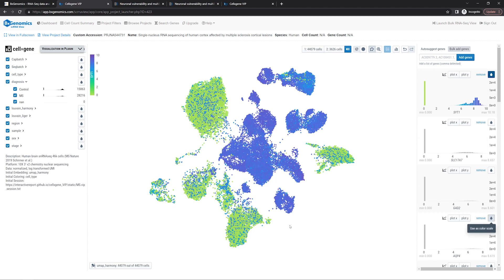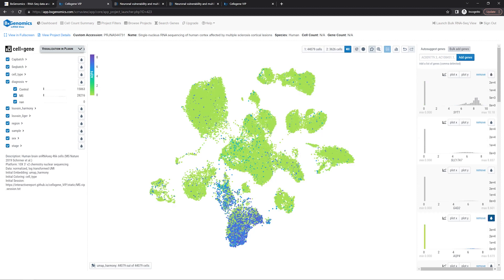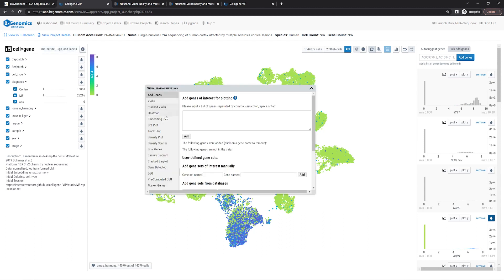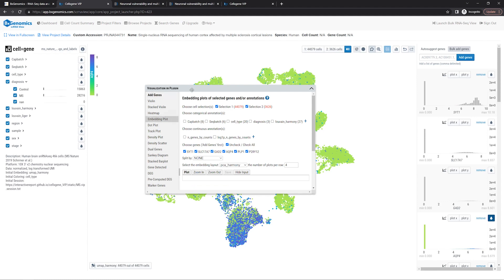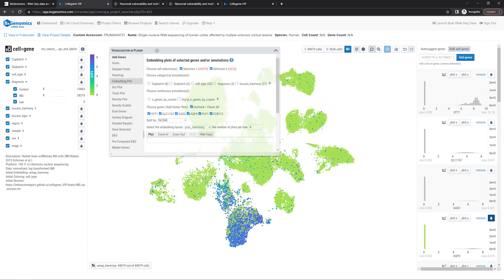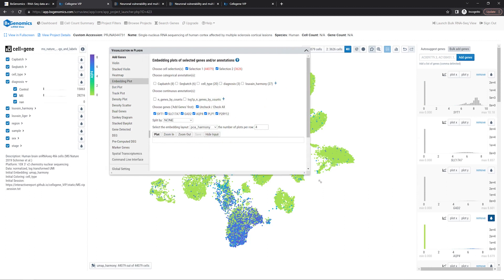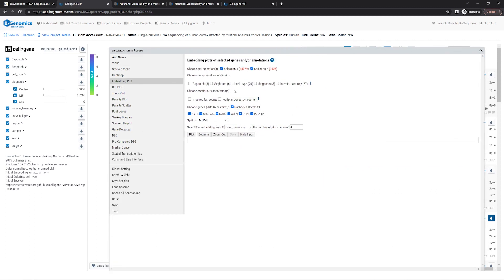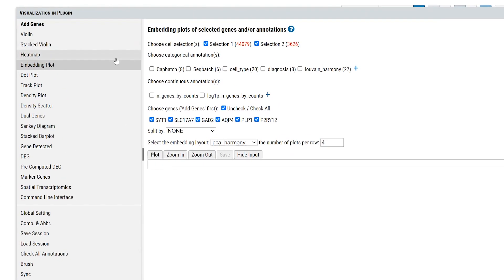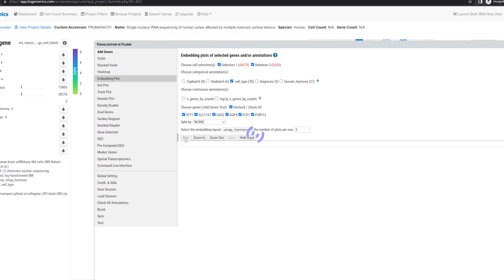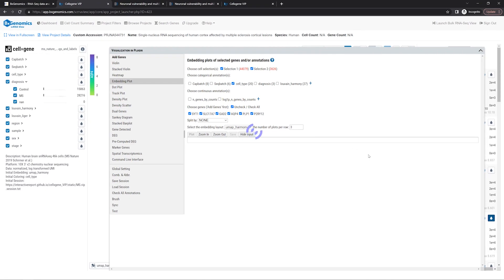AQP4 is a marker specific to astrocytes. Next, we're going to make UMAP plots for all marker genes. To do this, open the visualization and plug-in window, also known as the VIP window. Drag to make the window larger, and choose Embedding Plot from the left menu. Choose Cell Type as the annotations, UMAP Harmony as the embedding layout, and use three plots per row since we have six genes. Click Plot, and the tool will generate a grid of UMAP plots for the marker genes.